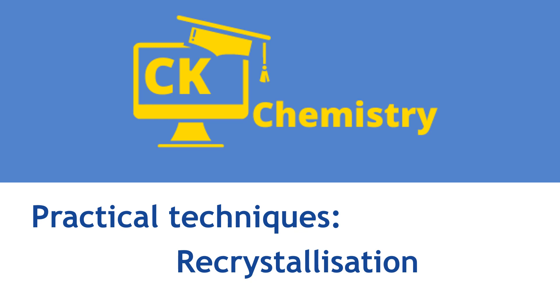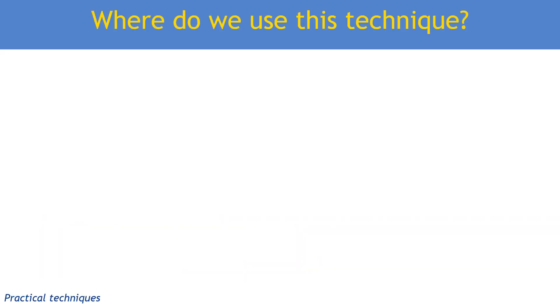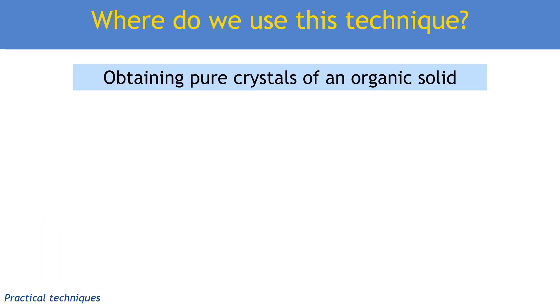In this practical technique video, we're going to look at the technique of recrystallization. We use it to obtain pure crystals of an organic solid.